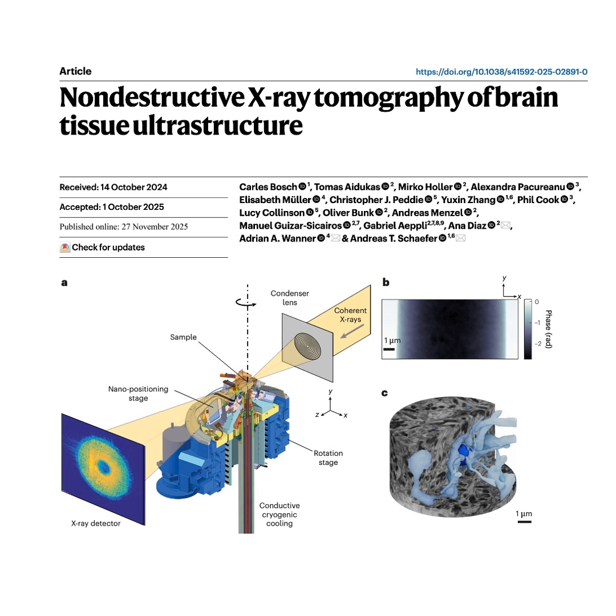Exactly. So our deep dive mission today is to unpack the synergistic solutions, this three-pronged attack involving materials, cryogenics, and computation, that finally let researchers break that 625x dose barrier and unlock X-ray tomography for brain mapping. And let's start with the first, most immediate challenge.